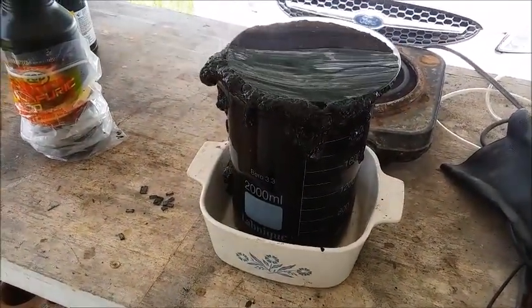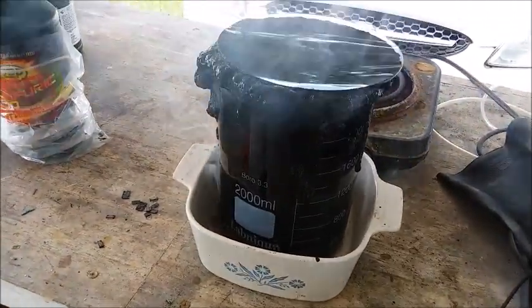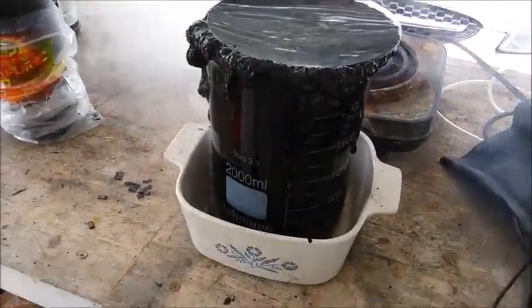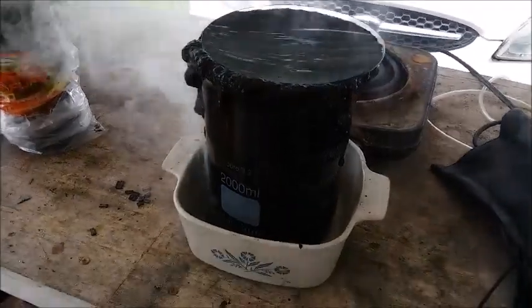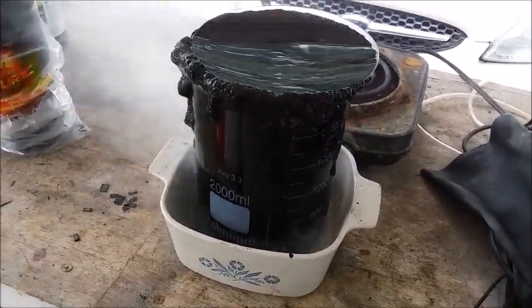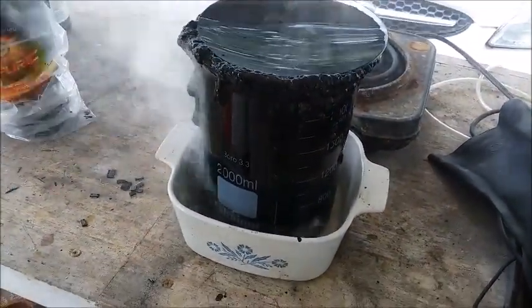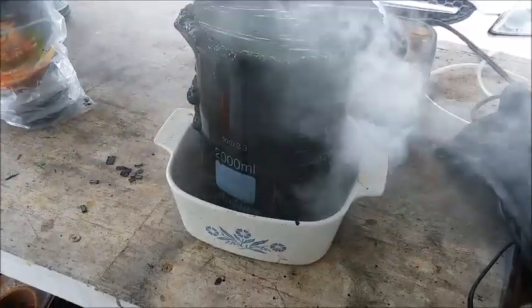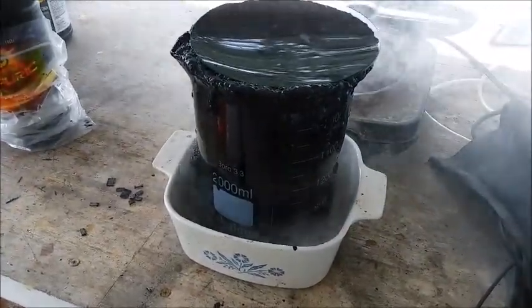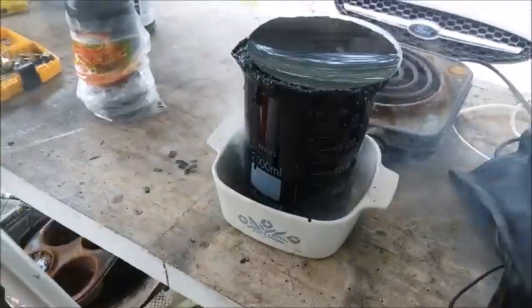Here's one of the dangers of doing it this way. I thought I had it in a tall enough beaker, and still it's overflowing. It really foamed up on me. I walked away for 20 minutes and this is what happened. So yeah. Once this gets a little more under control, I'll get my gloves on and I'll pour in some more acid to beat the foam down.